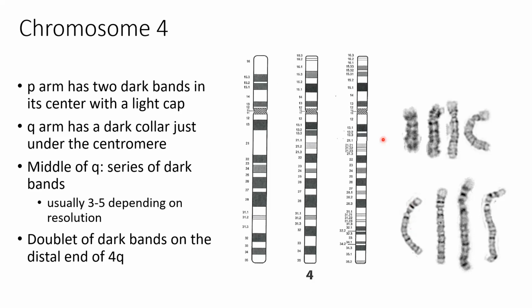So you're way too young to have worn shoulder pads. It's basically something at the top of the shoulder of the long arm. So here's the centromere right here, and then this really dark band is distinct. It stands out, right below the centromere. I see. Okay, thanks. You're welcome. I'm sorry, I'm using terminology that you're way too young to have known.